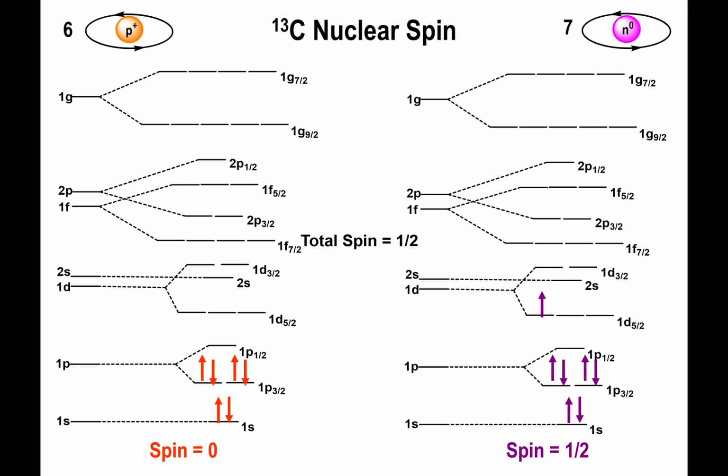Now that creates some problems of its own, because carbon-13 is the least abundant natural isotope of carbon, if you don't count carbon-14, that is. So due to that, you have to have a really concentrated sample to get a good spectrum. You have to basically run the experiment for longer times than you would for an experiment in which you were looking at proton, but we'll get to that later.